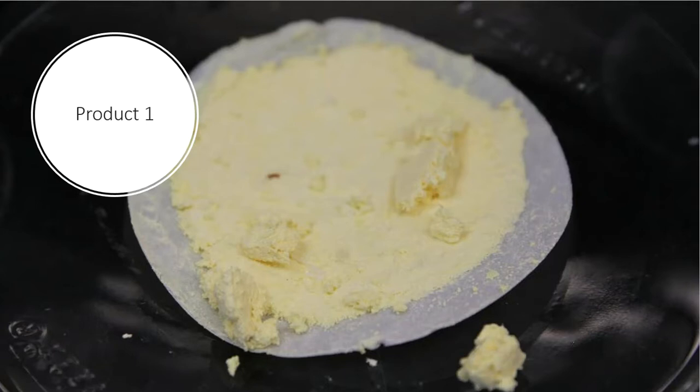So this is dirty. These crystals are dirty. They're trashy. They're nasty. We need to clean them up. So the way that we'll do that is through the recrystallization process, and that's not yet happened. All right, so here is an observation of product number 1, just a close-up, so that way you can see that a little bit better.